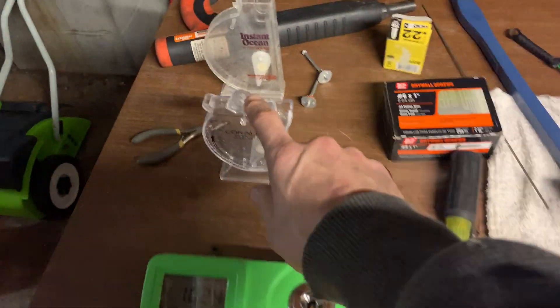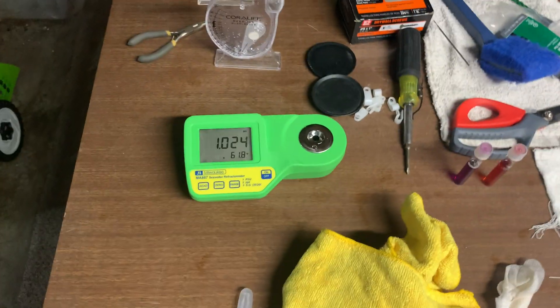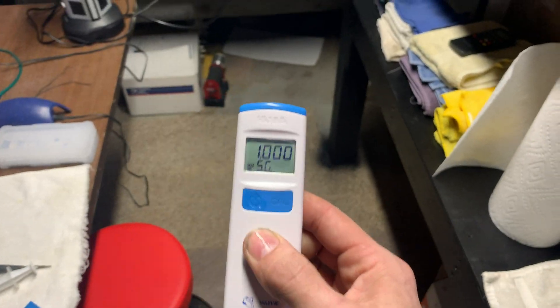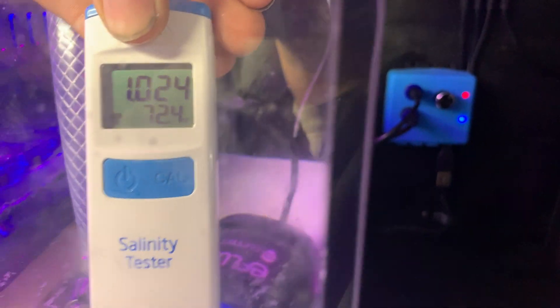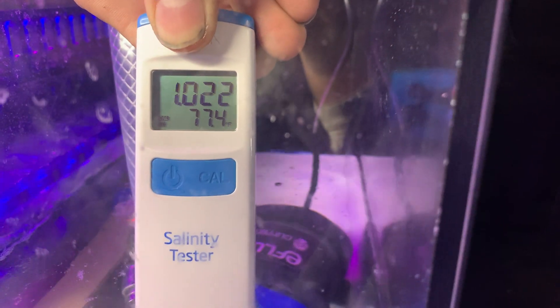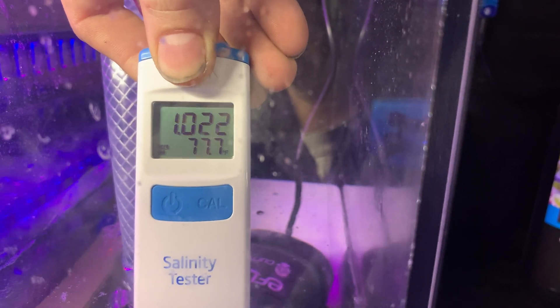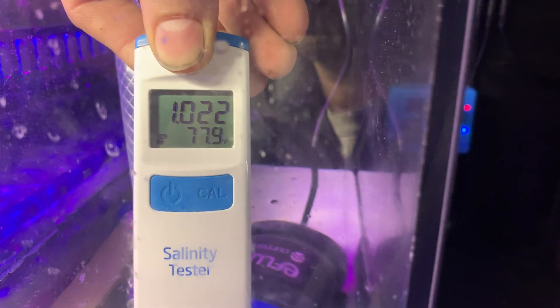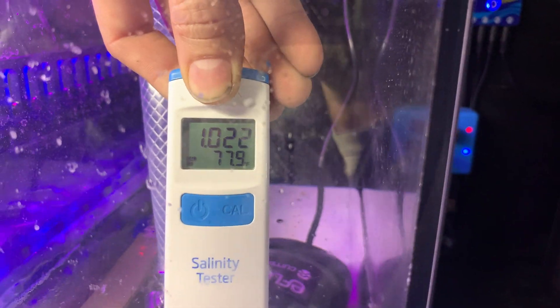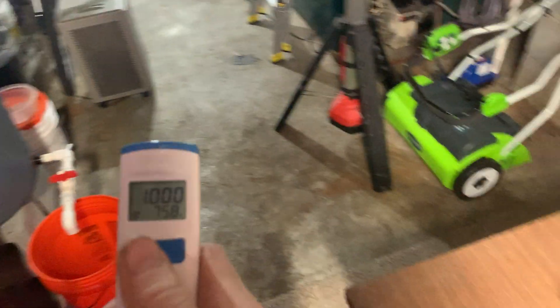I tested it with my refractor and I tested it with my hydrometer. So this thing is pretty accurate. But this here — the Hanna Checker — I have tried. When I first got this, it was identical to those. Now that's the reading I got from all these waters, because I have them all to the same salinity. I'm going to stick this one in here and watch. It should be 1.024, but it usually doesn't read it. Make sure you shake out any bubbles. And here we go: 1.022. That's off quite a bit. This is freshly calibrated. So that's off by 0.002, which is kind of a lot.